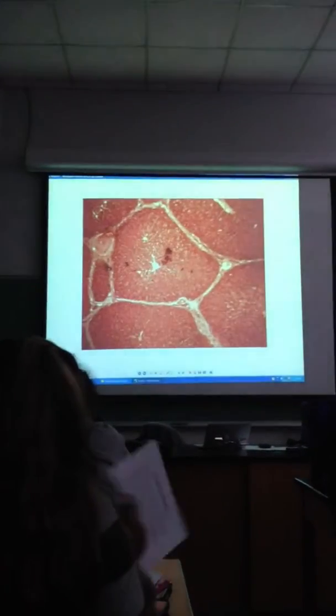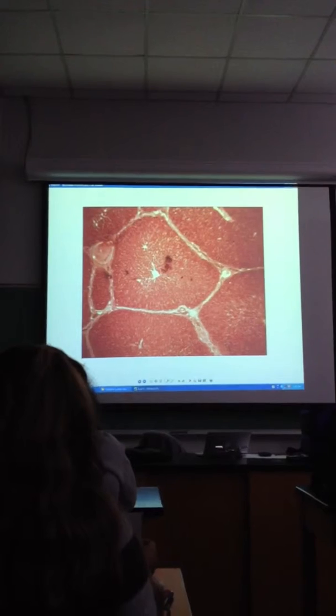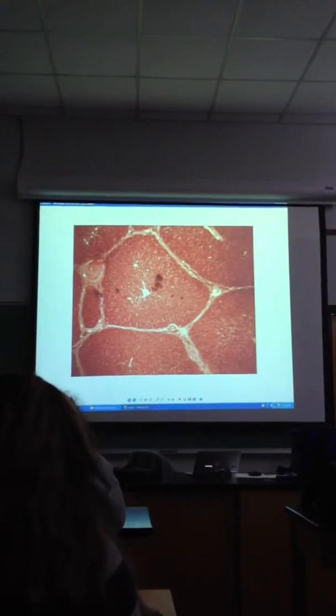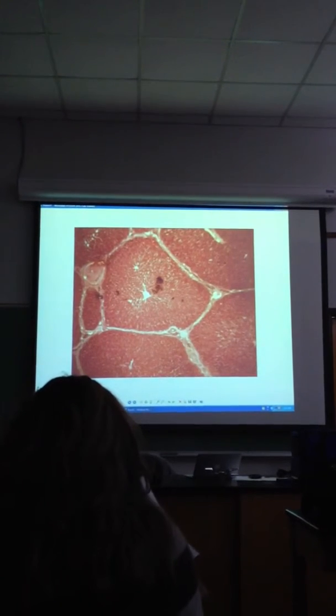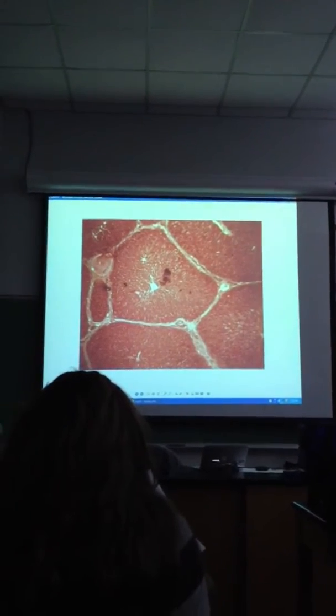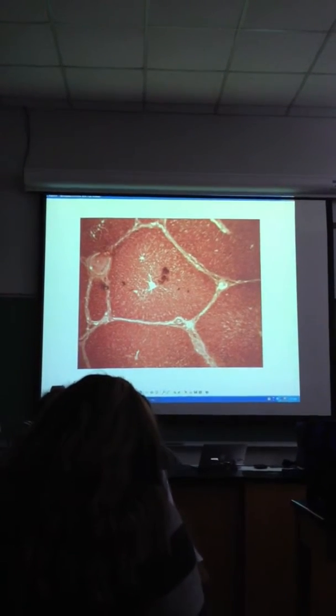Last but not least, the liver. Hexagonal in shape. The liver lobules there. If you look at any images in your book, I think there's actually a histological image of the liver in your lab manuals. It'll look roughly like this.